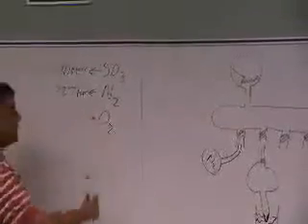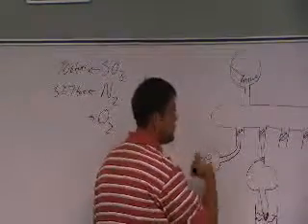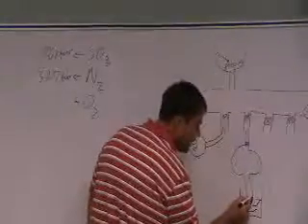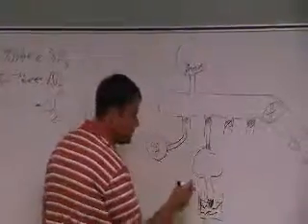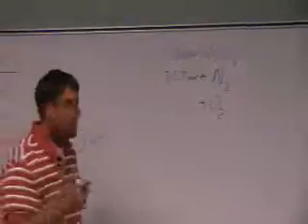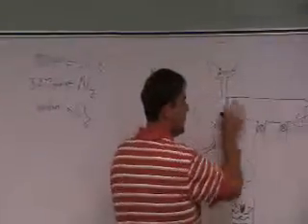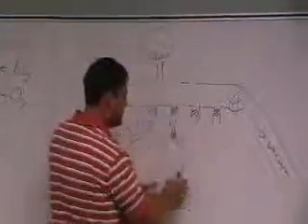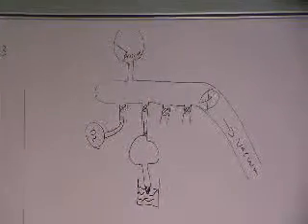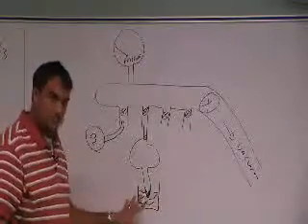We got one more thing to deal with, which is oxygen, so we go find ourselves an oxygen tank. Do the same thing, and now we've got yet a third layer in there. So you see how we've got 3 layers now? 400 torr. Now, pull all this out, turn on the vacuum, close this, pull this off. Now you have a gas bulb in your hands. And let it melt. Let all this stuff melt.